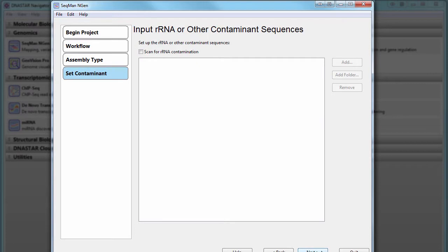If needed, you can scan for ribosomal RNA and other contaminant sequences by using the Scan for RRNA Contamination option, and then adding sequences for your contaminants.